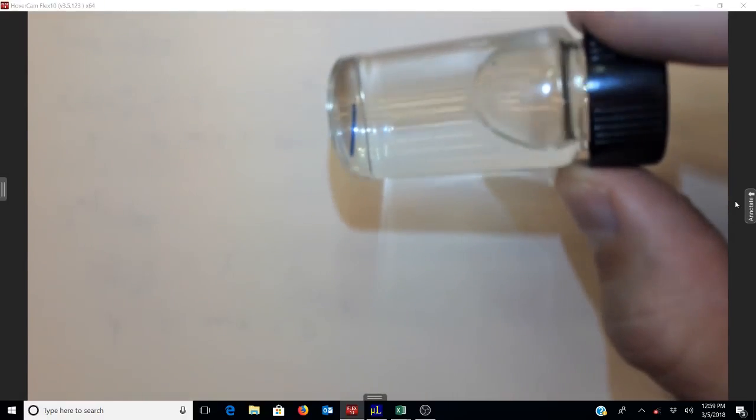But before we do that, I do want to show you one quick thing. If you notice, when Tim put this in, it was blue. Now that we take it out, it's clear. Did the dye disappear? No, it just got bleached. It's the same thing if you have a white t-shirt and you bleach it. The stain doesn't disappear, it just turns colorless, okay? There's still dye in there, it's just a colorless version of that molecule, if you will.